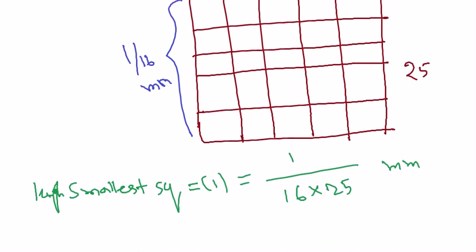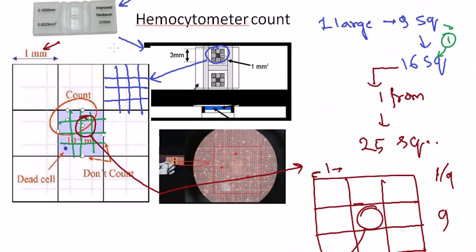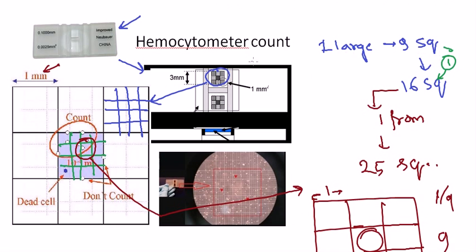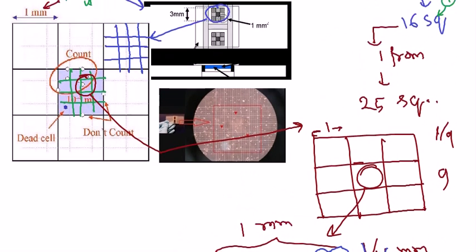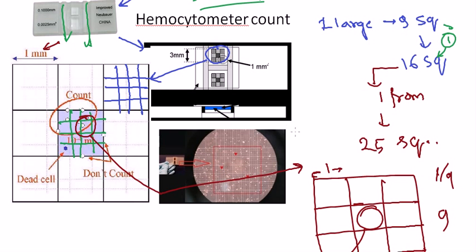Now what we do is add our sample to either side of the hemocytometer. We place a cover slip and inject the sample using a micropipette. It requires only about ten to fifteen microliters of sample to load. Excess sample will overflow through the troughs that are designed into the slide — a very intelligent design. Once loaded, we place it on the microscope stage and observe.